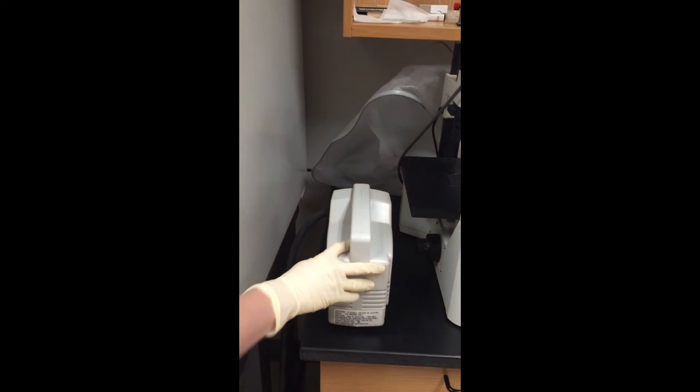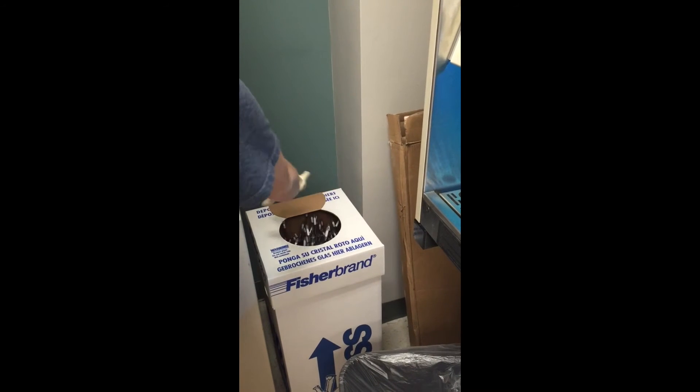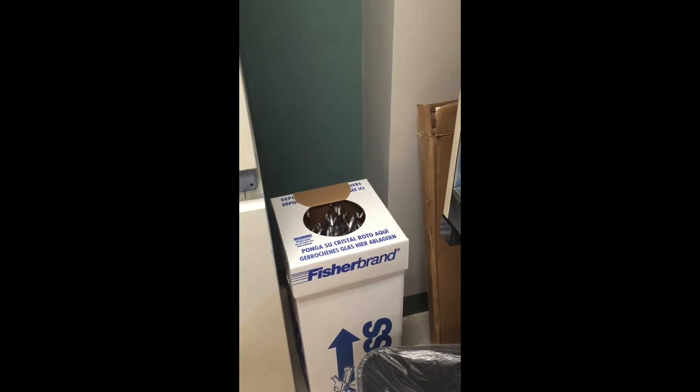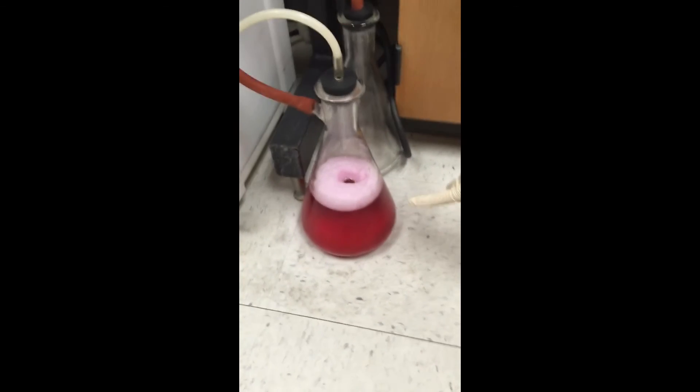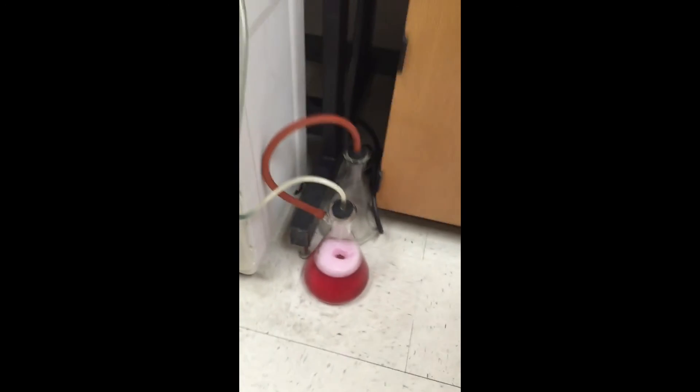Then a couple things to double check before you leave. Turn off the vacuum. And if this is overflowing, if pipettes are sticking up, make sure you tell someone. Look down here — if this is really full like it is right now, you also need to tell someone and we'll empty it and put more bleach in it.